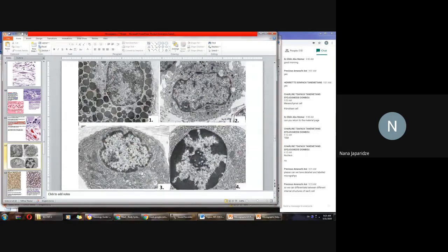This is the cell body, and it is surrounded, of course, with a cell membrane, and this thin line represents the cell membrane. You see nucleus in the cell. You see rough endoplasmic reticulum. Look, this is rough endoplasmic reticulum here, and nucleus, okay, with a nucleolus.